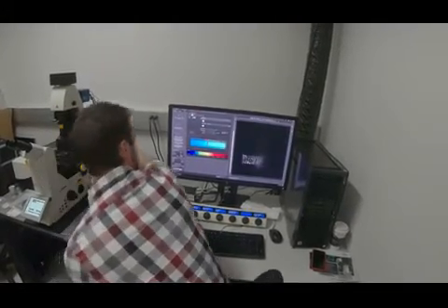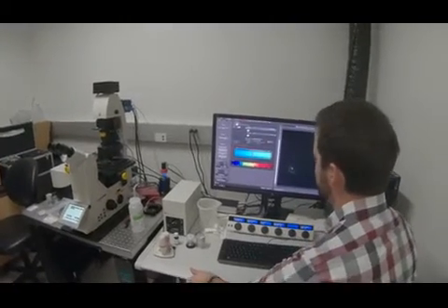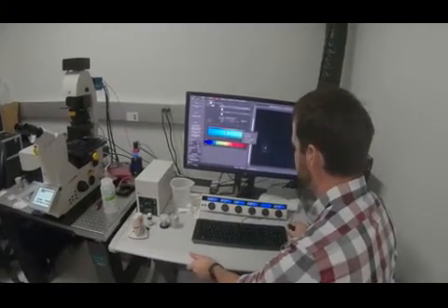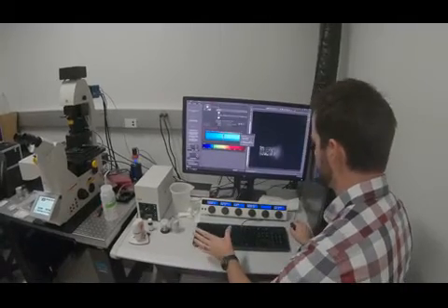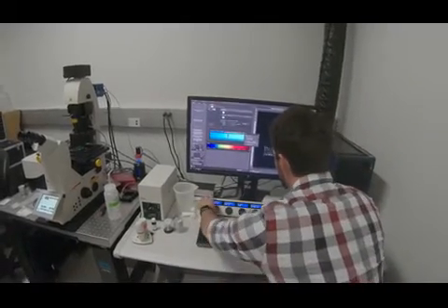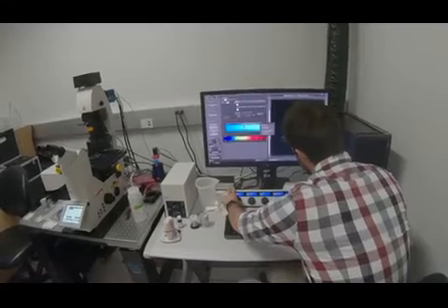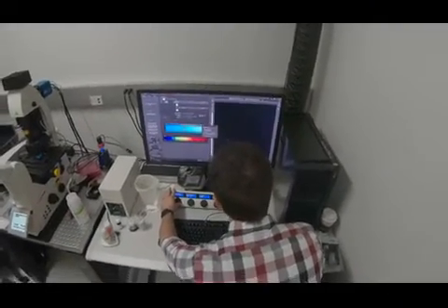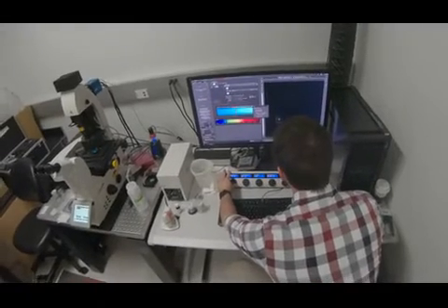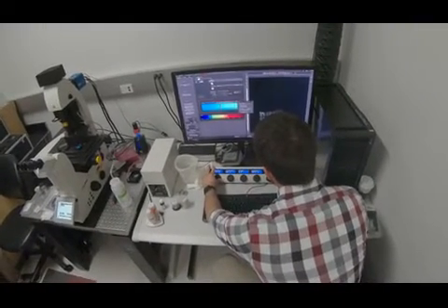Okay, that's pretty good. Okay, now we'll stop that, go back to the mirror calibrations, go live. So our left mirror will use the right mirror as the reference. I'm right-handed. It doesn't actually matter. Like that. Define, and then left mirror.